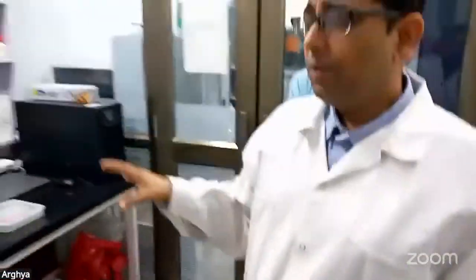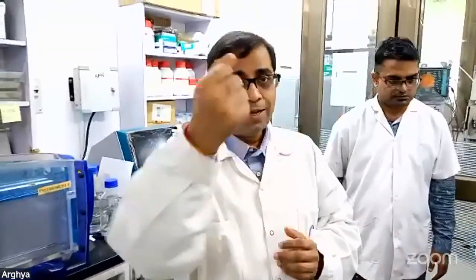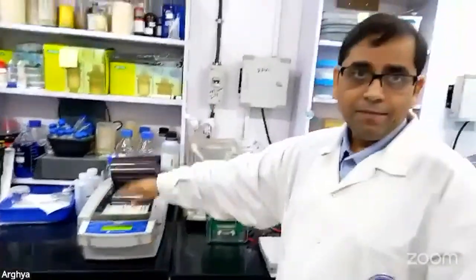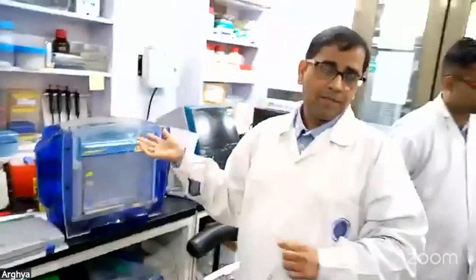So these are some basics about how one could do 2D gel and even some level of quantitative proteomics using 2D gel. But if the goal is to look at quantitative proteomics, I would recommend you look at the labeling approaches. For example, you can take 3 samples and label them with Cy3 and the 3 other samples with Cy5. Make the internal standard by combining all of them, and that can be labeled with Cy2. Then you mix all of them and do the same separation, with isoelectric focusing as the first step and the second dimension separation as the second step.